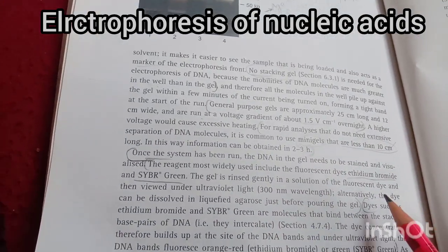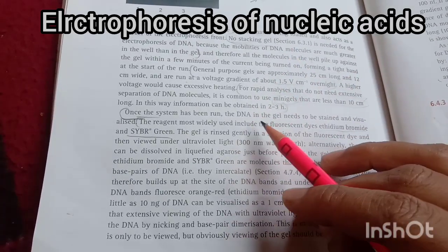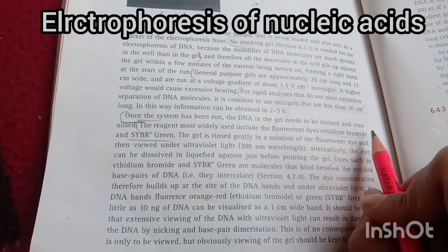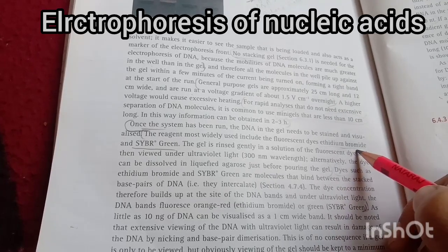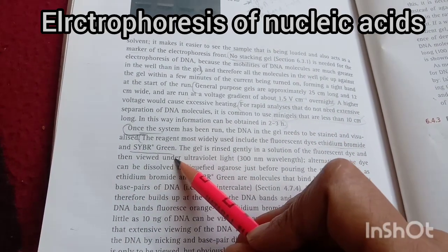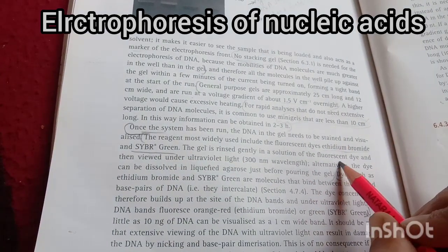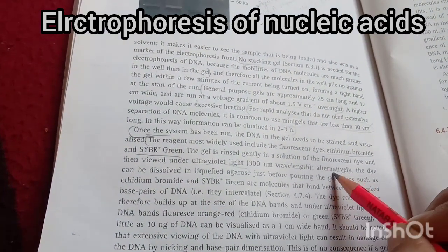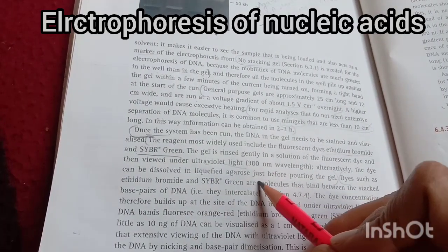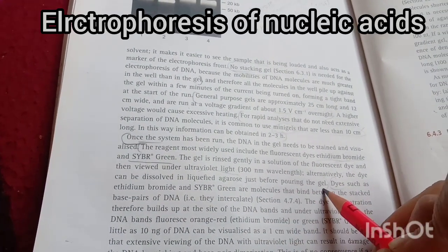Now if we talk about the dyes, once the run is done, the DNA gels need to be stained with dyes like ethidium bromide and SYBR Green, okay? The gel is rinsed in a solution of the fluorescent dye and viewed under UV light. Alternatively, the dye can be dissolved in the liquefied agarose just before pouring the gel.